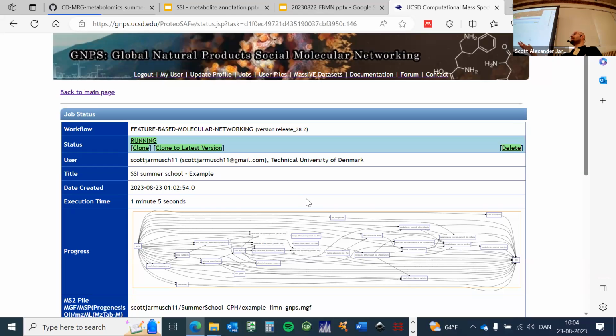So they're either just superfluous files. For instance, you can access spectral libraries through some of those folders. Or in my inputs, I had pulled up some massive data sets. If you have a massive data set you want to pull data from, you can pull that file, open it up and click individual files in that massive data set. So there's another way to grab files. Yeah, if you upload the MZML file, yeah.